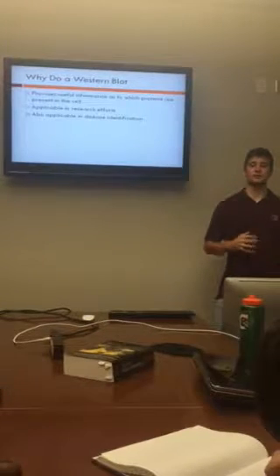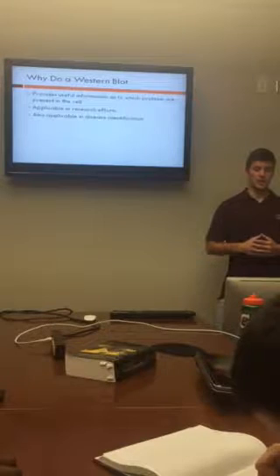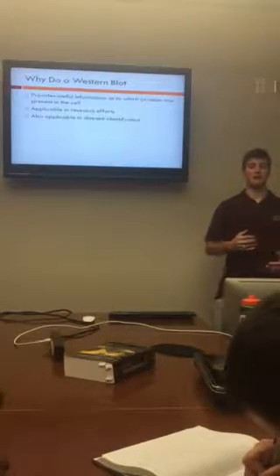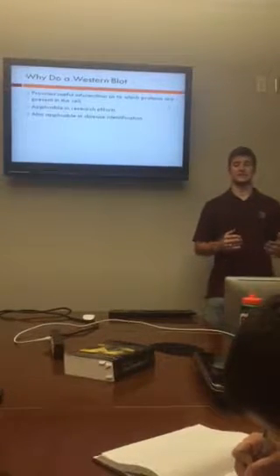And the second thing is, why do a Western blot? How does knowing how to do a Western blot benefit you? The Western blot provides useful information as to which proteins are present in the cell. And so this is applicable to primary research efforts as well as identification of disease in patients.